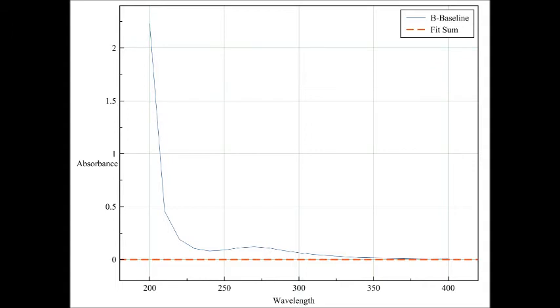You take formaldehyde and convert it into sugars, such as ribose. But I couldn't find a definitive absorbance spectrum for ribose, and so I decided to buy some ribose online and measure the absorbance spectrum myself.